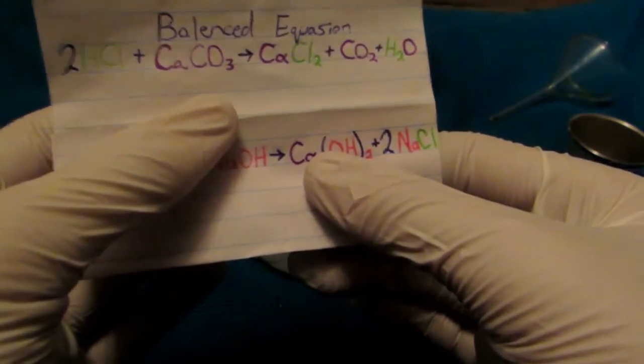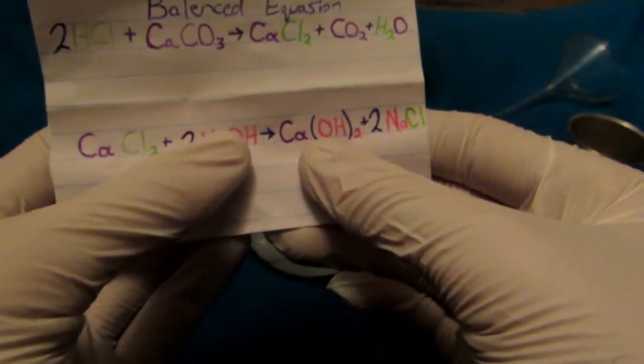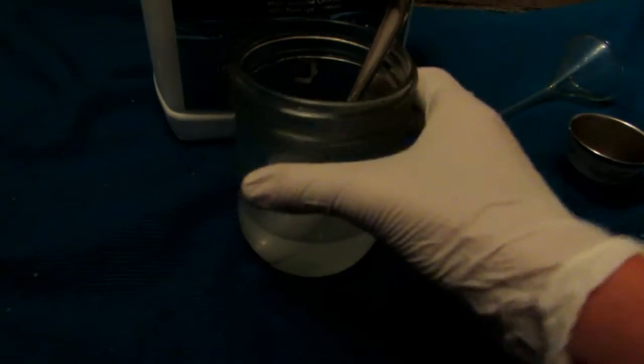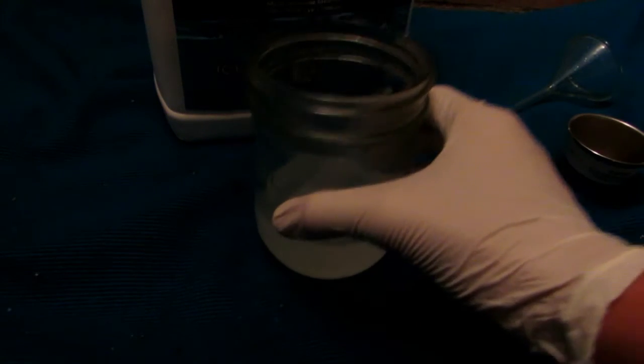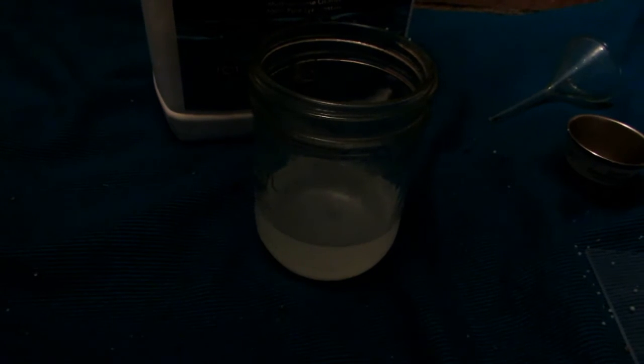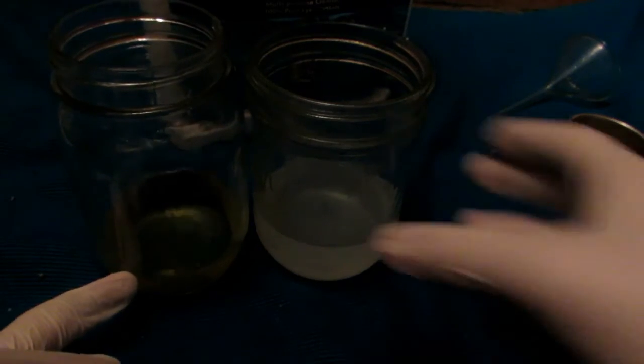We can then further wash our calcium hydroxide — since it is not soluble in water — to get rid of any remaining sodium chloride and other impurities, leaving us with a fairly pure calcium hydroxide product. The solution is now fairly clear. Remember to wear gloves as sodium hydroxide is extremely corrosive. Here's our calcium chloride solution, which is slightly discolored from impurities. Upon addition you're going to see a beautiful precipitate — just like that, there's calcium hydroxide precipitating out of solution.